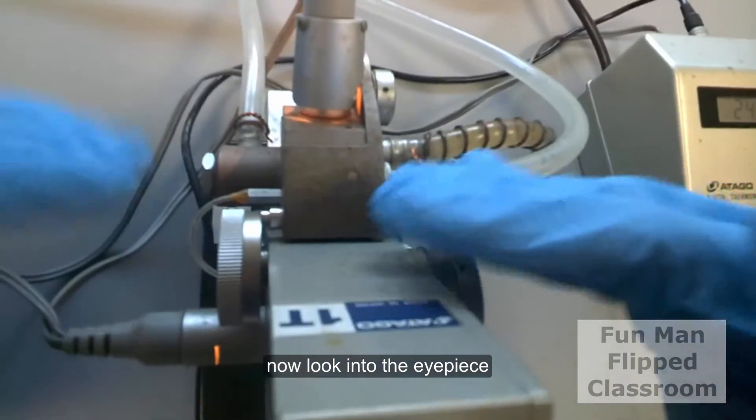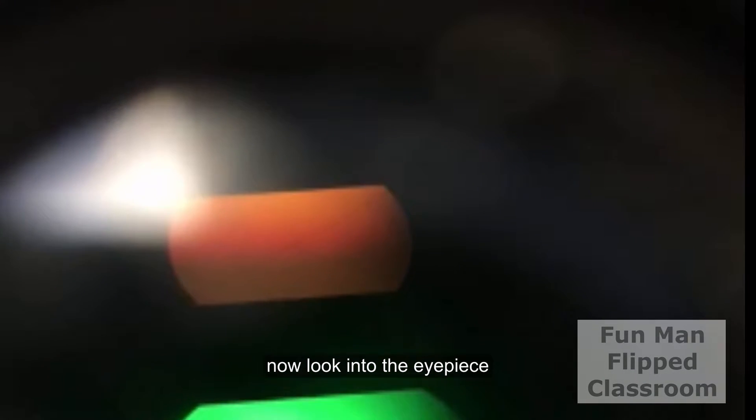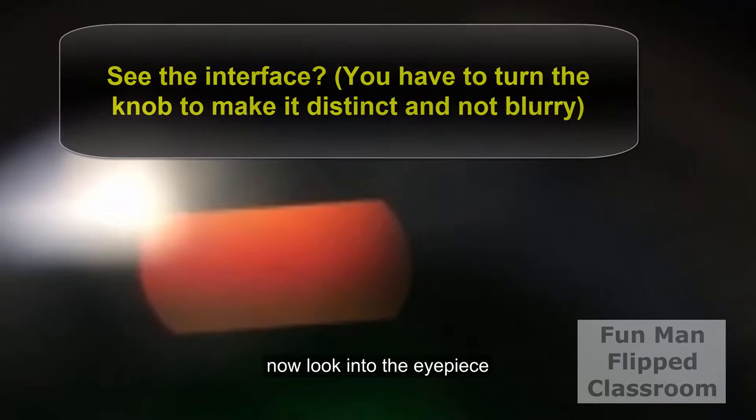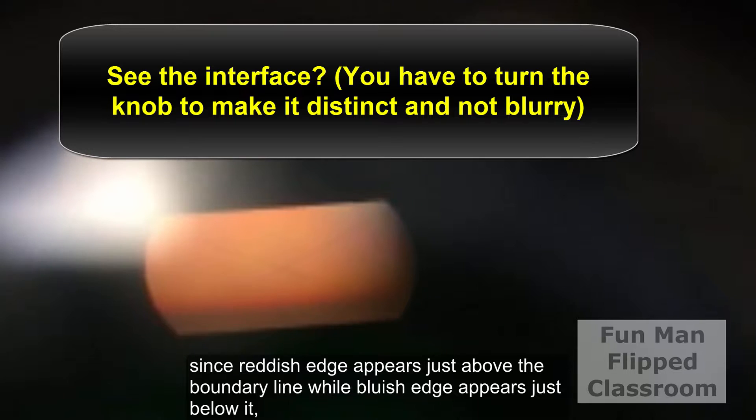Now look into the eyepiece. Turn the color compensation knob to achromatize the boundary line. And stop turning when the boundary line becomes neither reddish or bluish. Since reddish edge appears just above the boundary line, while bluish edge appears just below it.